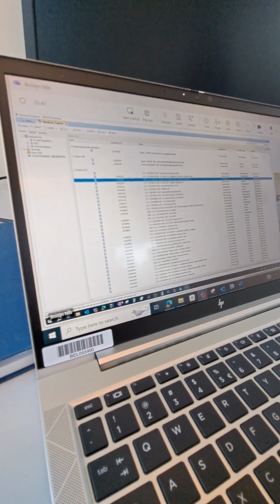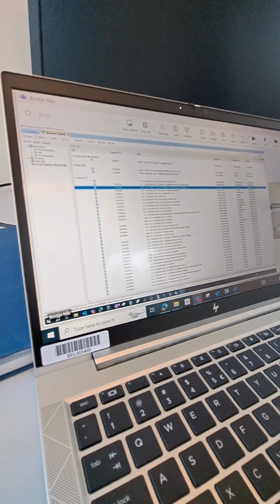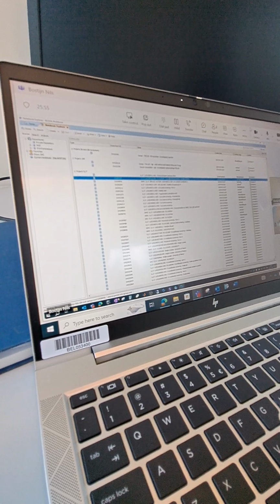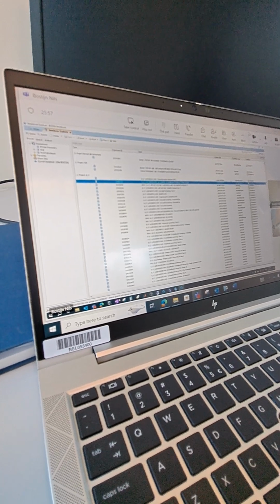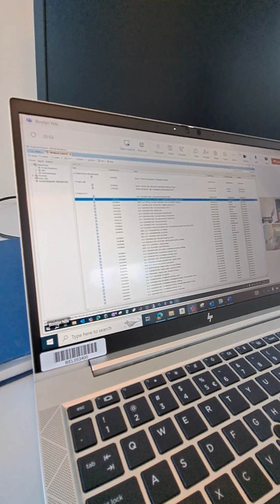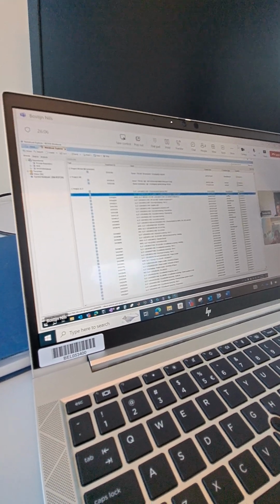And then here, this is also important, is the status in which the ELN is. Basically we have two. Plan and execute means it's open. Open, meaning from here you can open it, you can work in it, you can save it, you can check it in again, you're working on it.